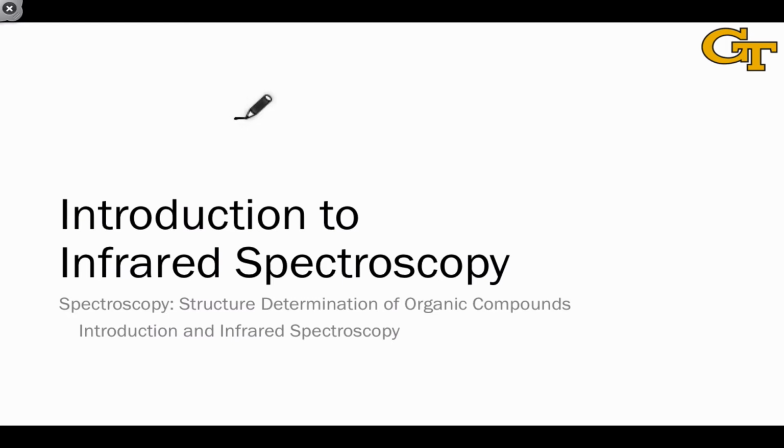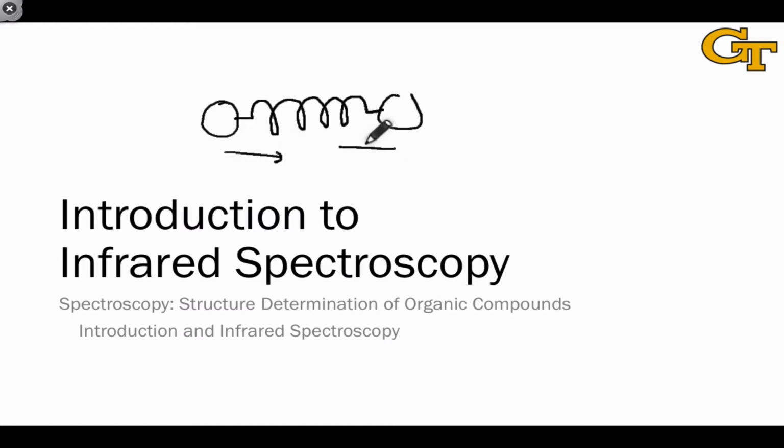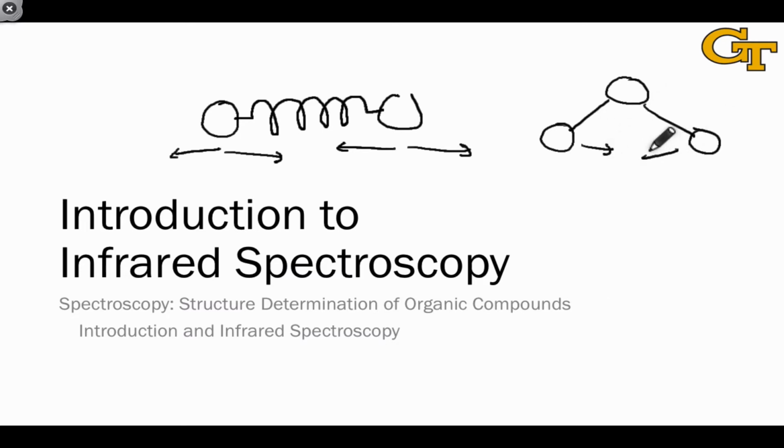In this video, we'll look at infrared spectroscopy in broad brushstrokes, the essence of which is the study of molecular vibrational motion. This includes motions like the jiggling back and forth of the atoms within a bond, or in a system of three atoms, the wagging back and forth of two atoms connected to a common central atom.